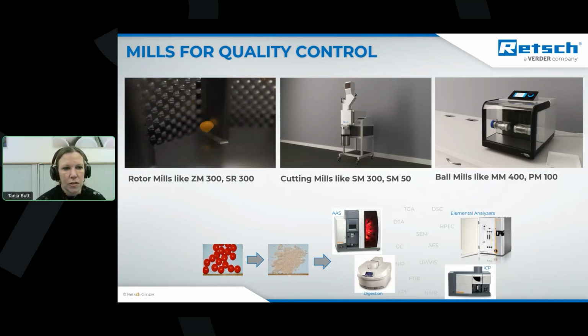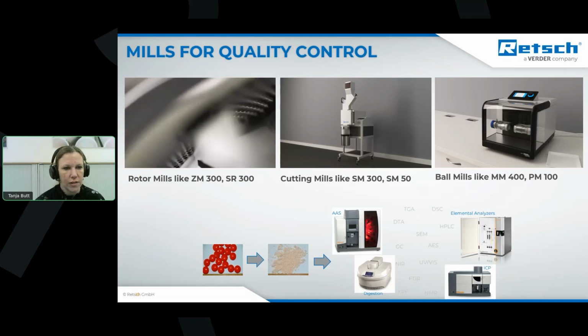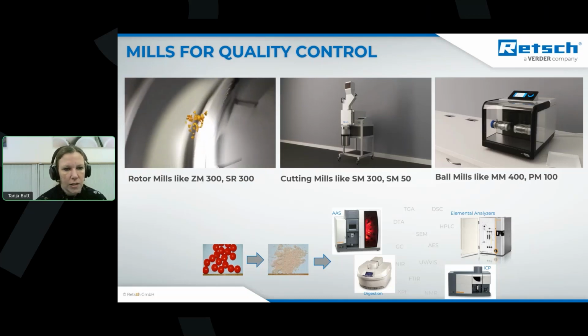And as soon as the sample hits the rotor, which rotates very, very fast, it is accelerated towards the teeth, and then you have a single crushing event.